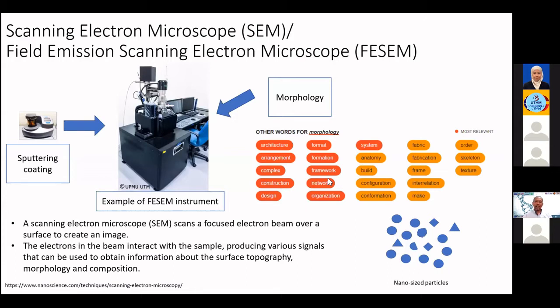No. So hopefully each one of you, once you put this picture, this image, or micrograph, in the thesis or the paper, please do a very comprehensive discussion on that particular morphology. Because the term morphology is not just the image or picture, it's actually arrangement, a framework, and construction.